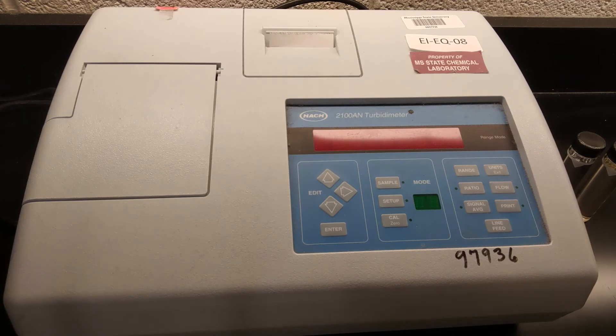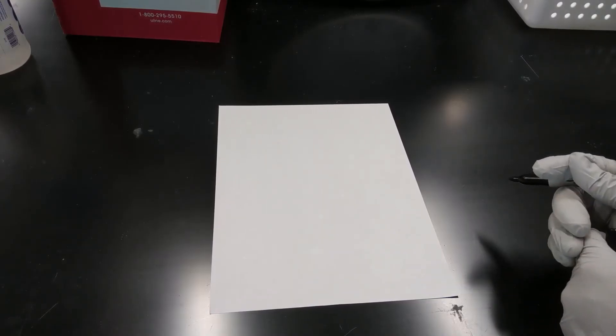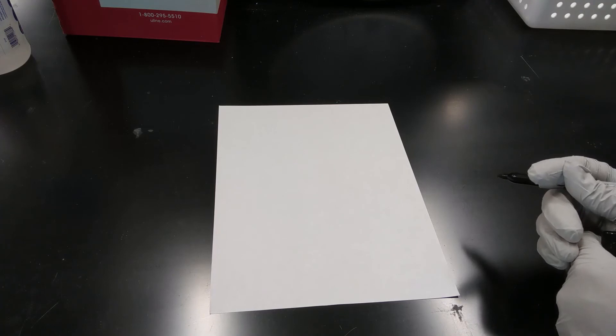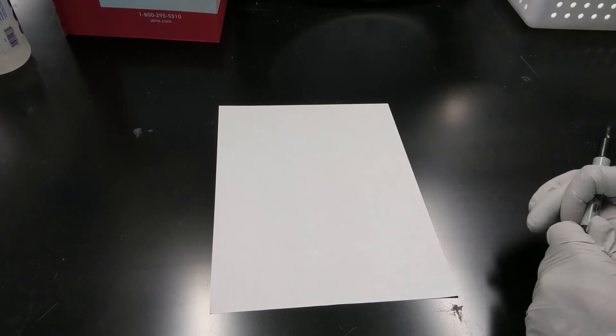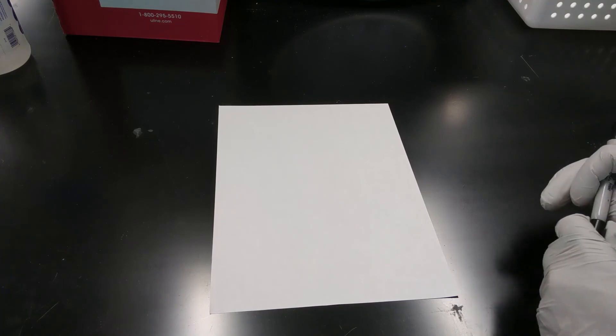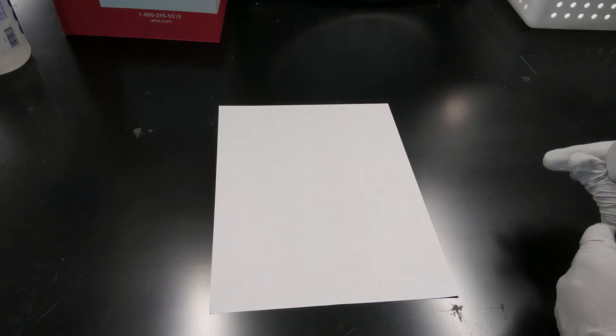So I'd like to do a brief explanation of how the turbidometer works. If all you wanted from this video was to learn how to use it, then you can safely click away now. But if you want to spend an extra couple minutes just understanding what it's doing, then keep watching.